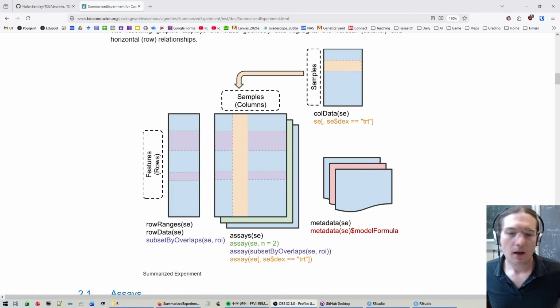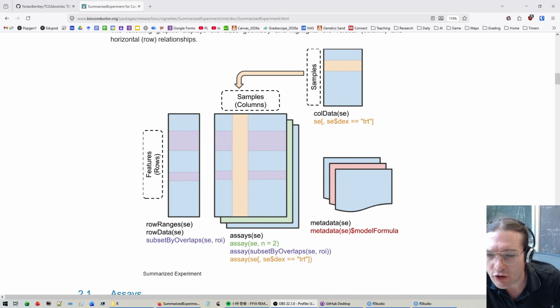what's happening. Okay, so the package that is organizing all this information into a single object, described here as SE for summarized experiment, is called the SummarizedExperiment package. It is a way to summarize biological data into a single object that allows us to combine genomic information, which is going to be stored in a section of the object called SE. So imagine that's like a container within a list type object.